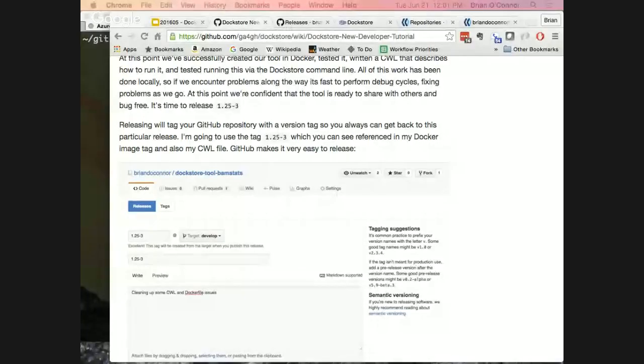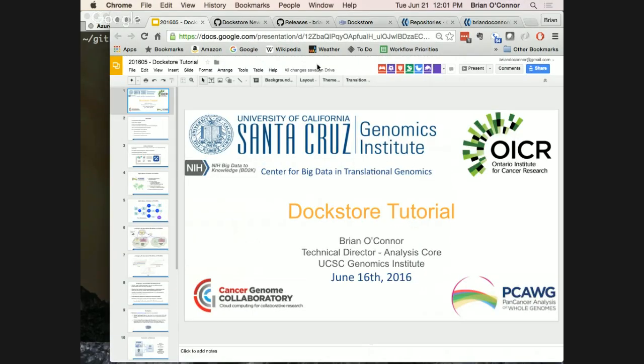So what I'm going to do today is switch over to sharing my screen, and I'm going to walk you through a tutorial that I put together. This is the second time I've walked through the tutorial, so if anyone's interested, there is a recording available. I've posted a link to it on various mailing lists like the Peacock mailing list and some of the mailing lists here in Santa Cruz. The content is pretty much the same as the previous tutorial, but I'm just going to go ahead and go through it again.